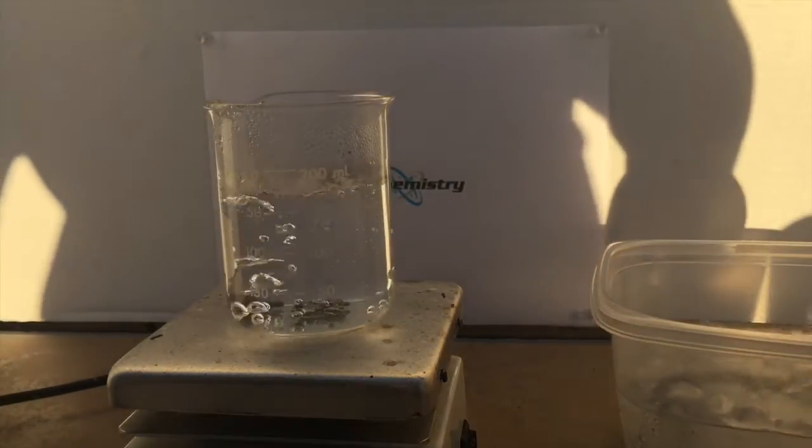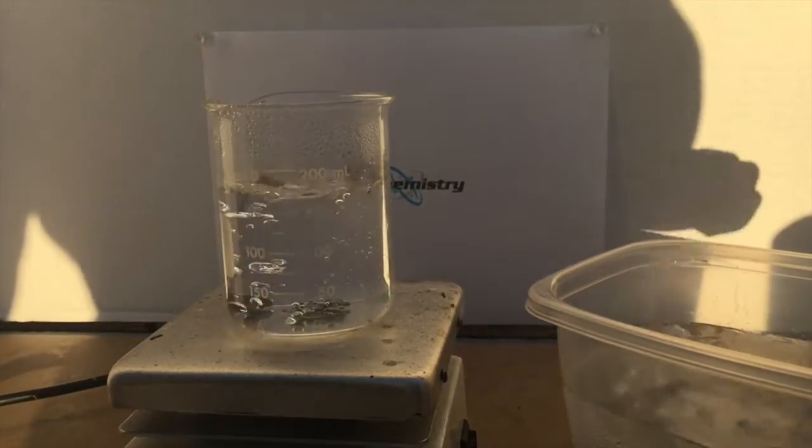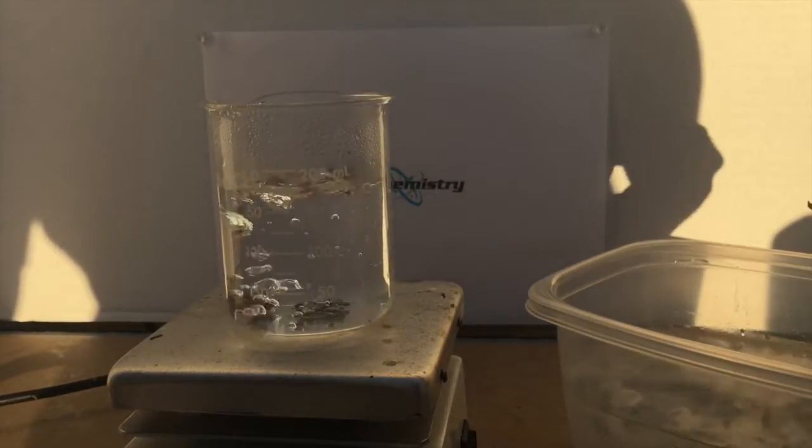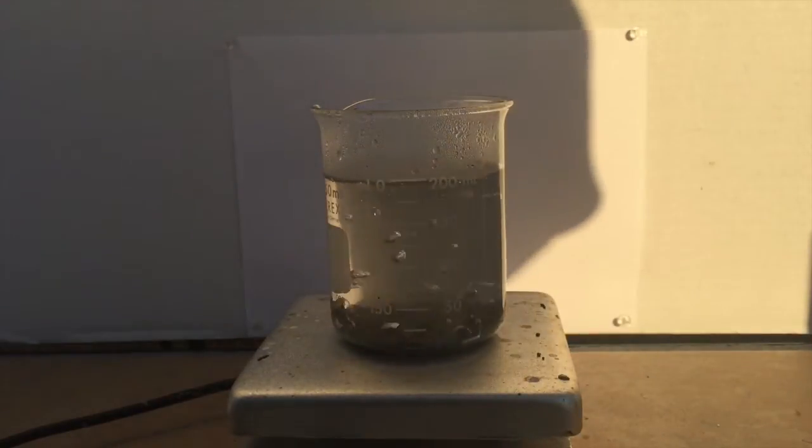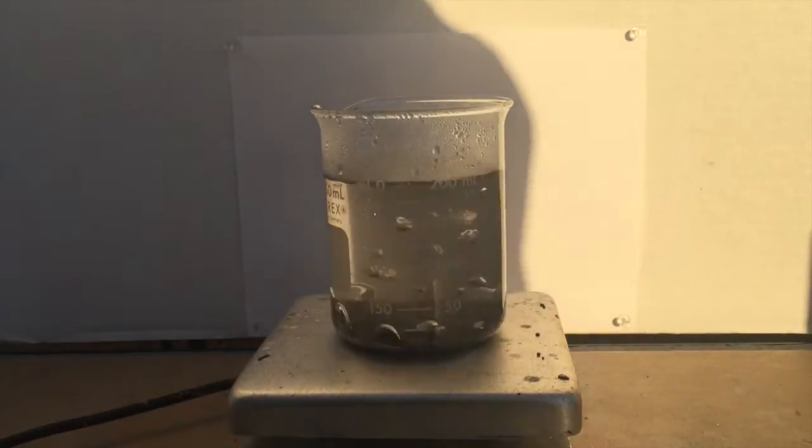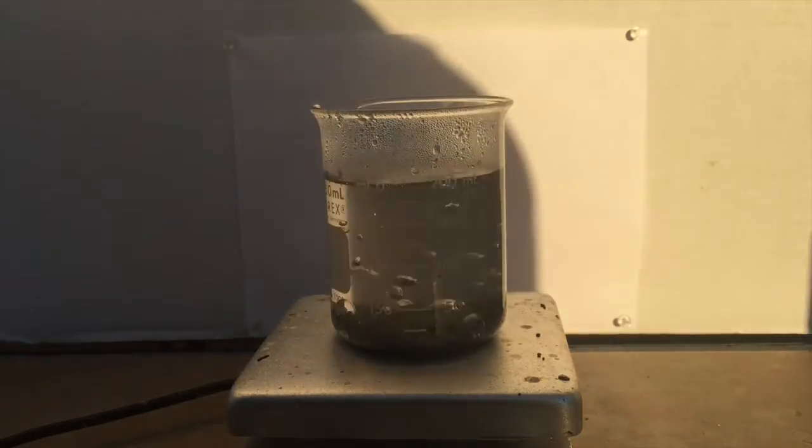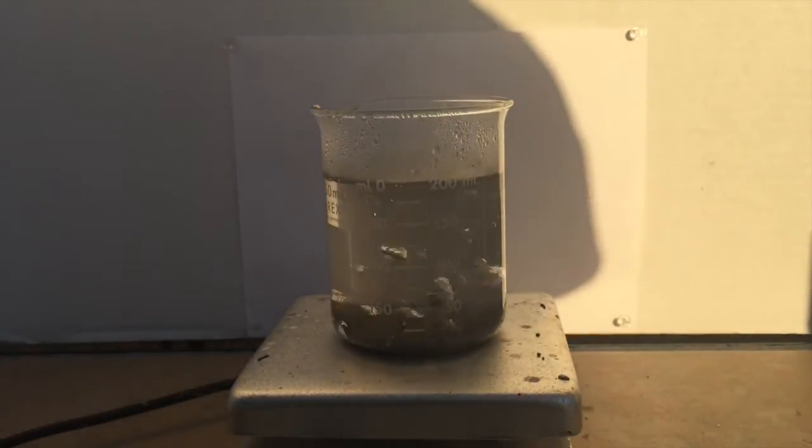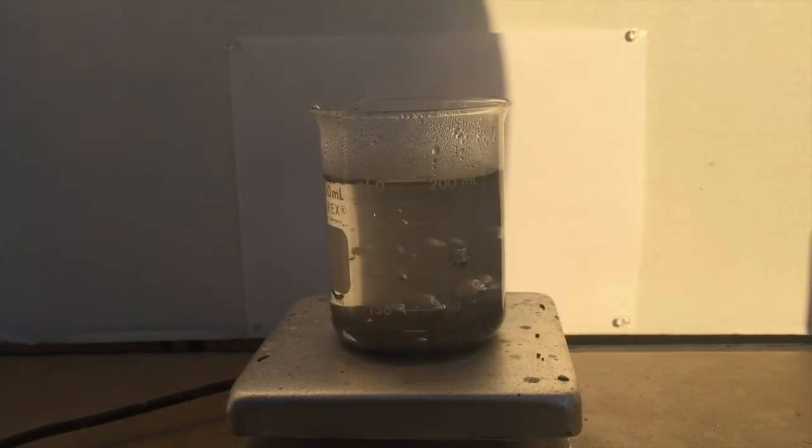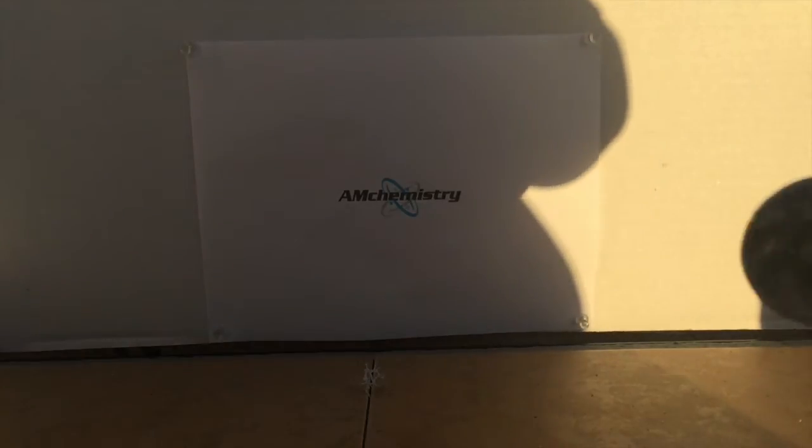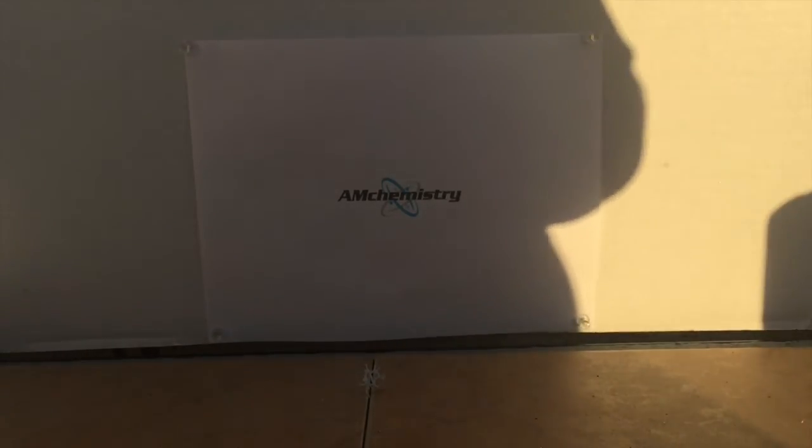Because my Wood's metal shot didn't work out so well, looks more like sponge. Here's all the Wood's metal alloy inside the boiling water. I'm not gonna make shots anymore, I'll probably just make a little bar. So now let me just cast it. Here's my little bar.